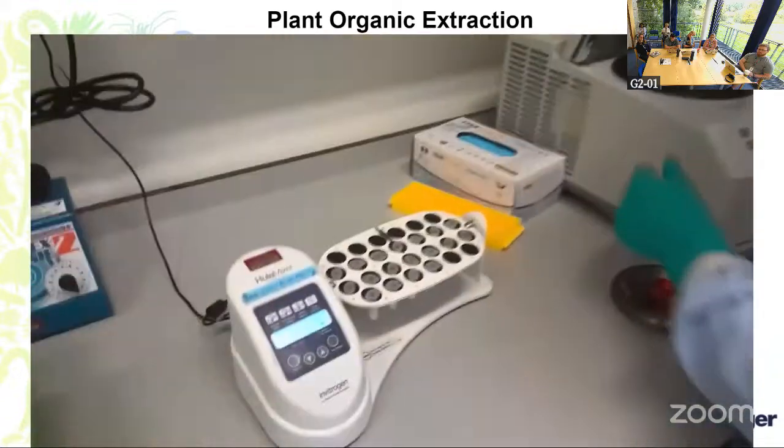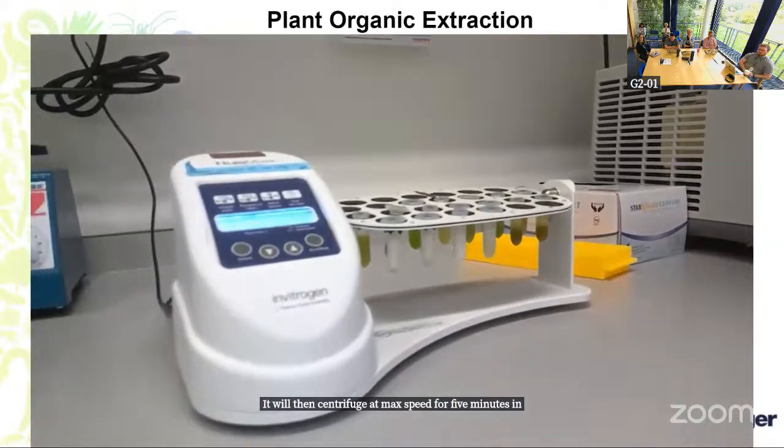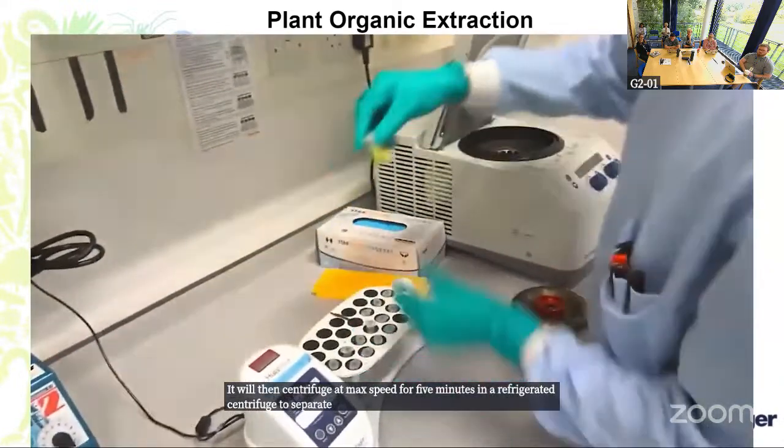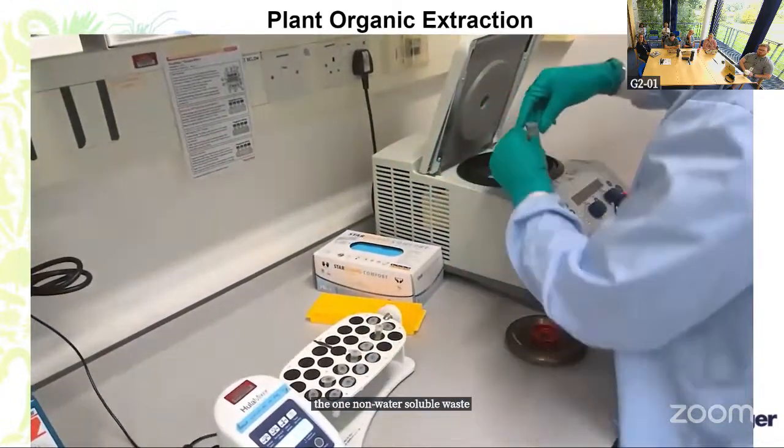It will then be centrifuged at max speed for 5 minutes in a refrigerated centrifuge to separate the phases and remove the non-water soluble waste contaminants from the high molecular weight DNA.